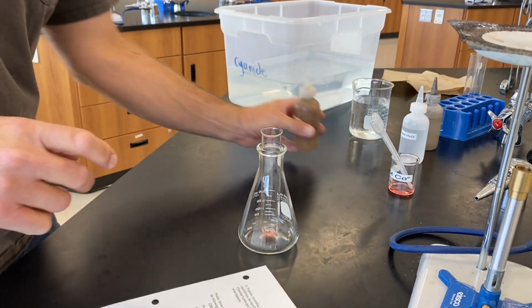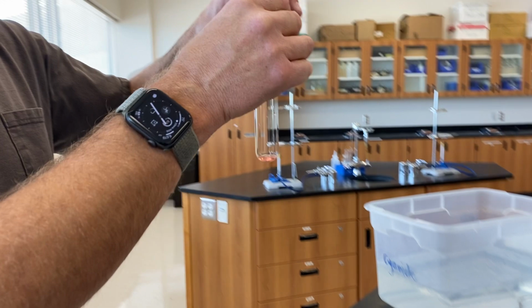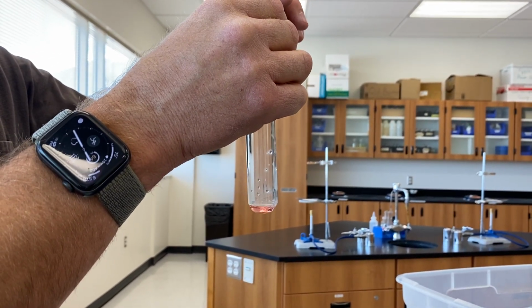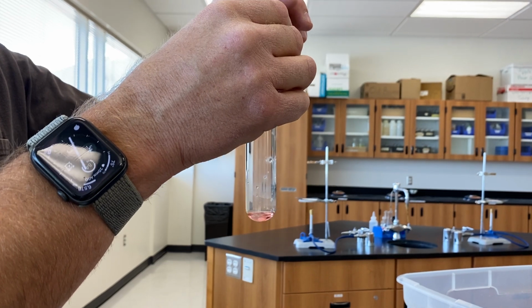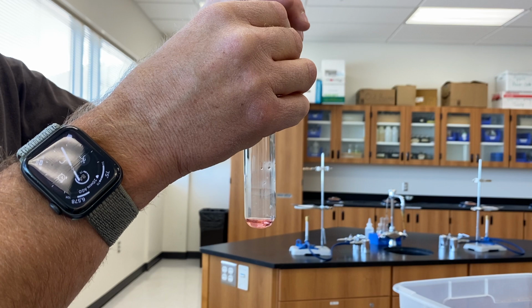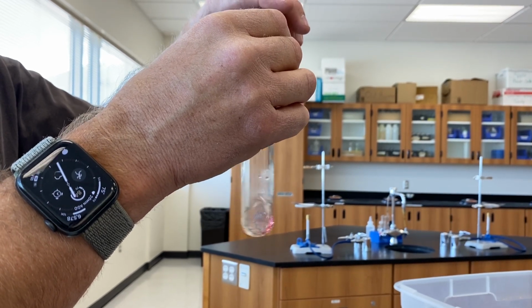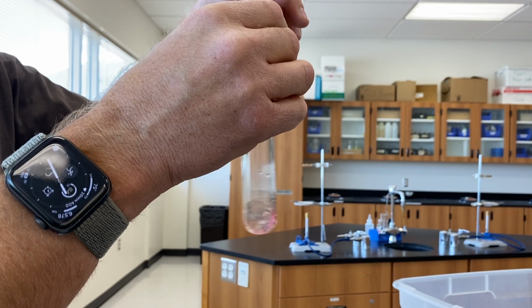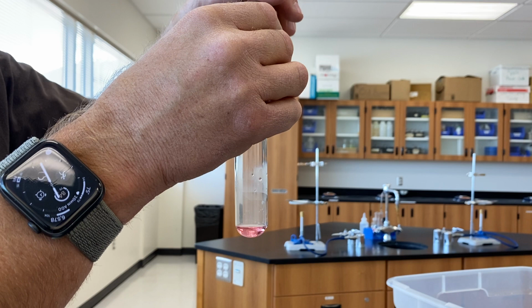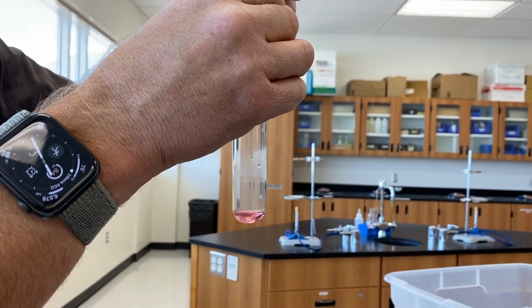Now at this point, we're going to start adding, step 4, hydrochloric acid drop by drop to the cobalt ion solution until we get a color change. Closer and closer and closer, continuing to add, continuing.